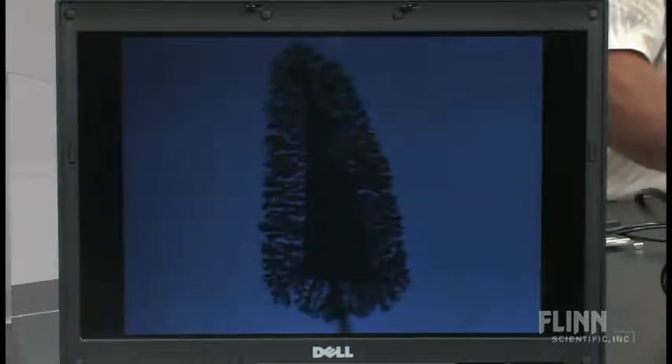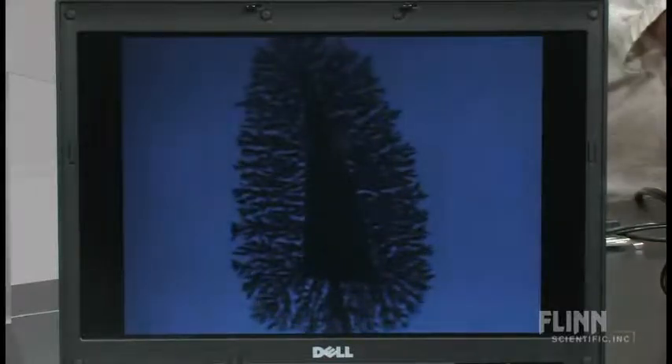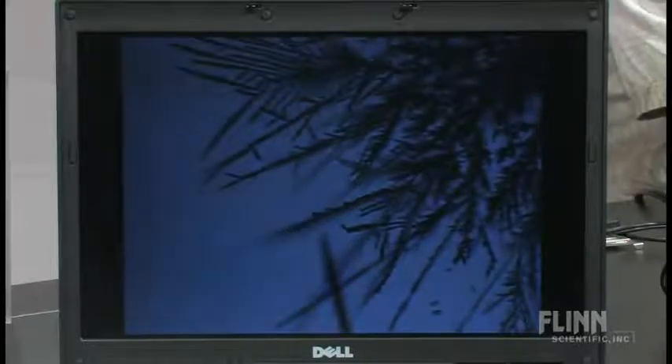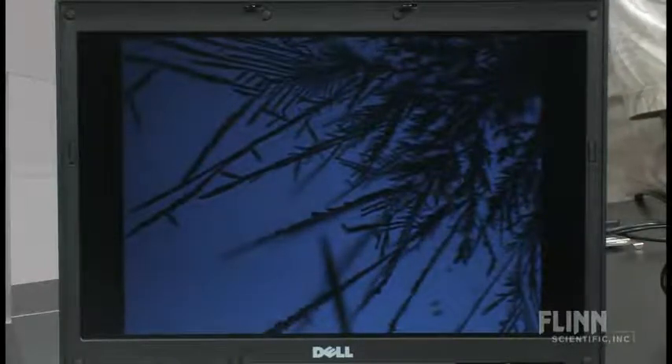Branches growing on my scrawny Christmas tree! If we turn off the overhead and look at the silhouette — switching to higher magnification, that's 40x, here's 100x — you can see those branches growing. They're called dendritic crystals. That's silver forming. Copper is going into solution as the silver comes out — it's a little ion-for-ion exchange. At different focus points, it really does look like a pine branch.